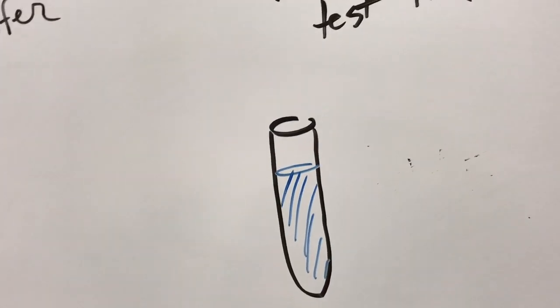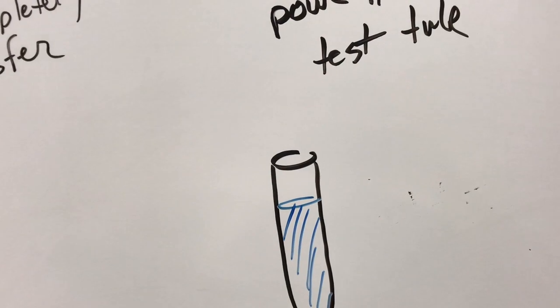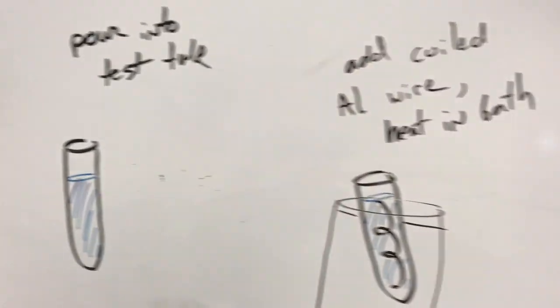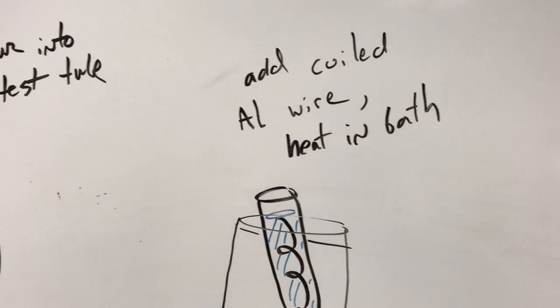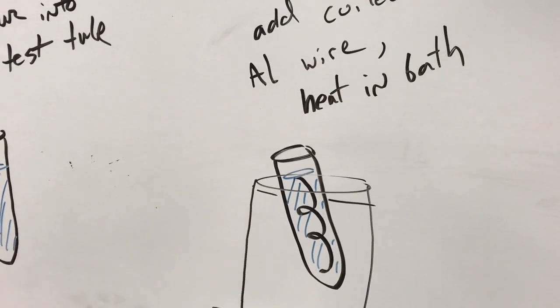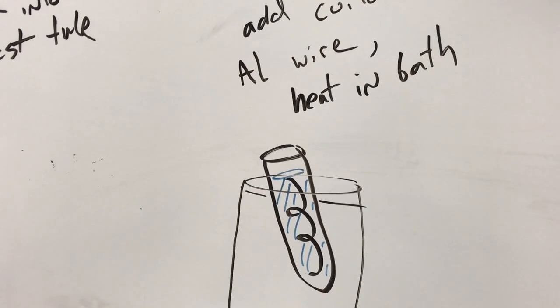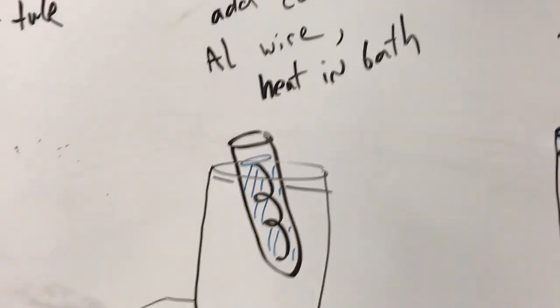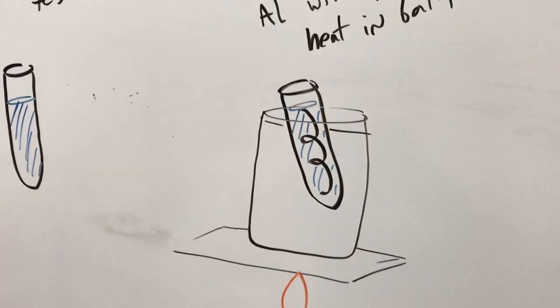Once we have our solution, our crucible completely rinsed out, we're going to pour that solution into a test tube. And then we're going to take a piece of coiled aluminum wire and place it into the test tube so it's submerged. And then we're going to heat that test tube in a hot water bath.